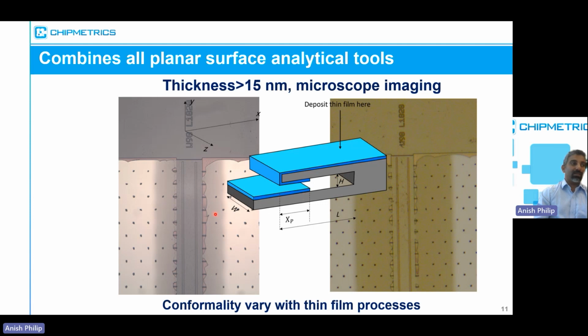So basically, this part represents this area. In this analysis we have seen the pictures from this opening with the W90, so that means it's mirrored. It has this opening that opens in both directions, and you can see this is very conformal on both the left and right side.